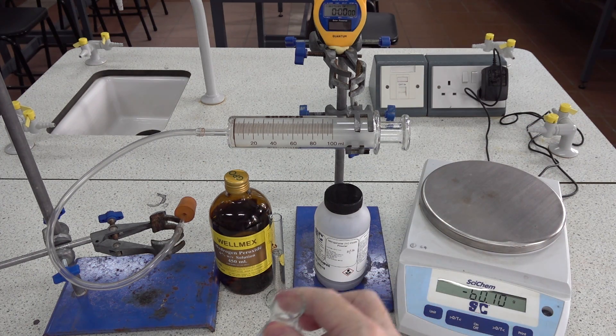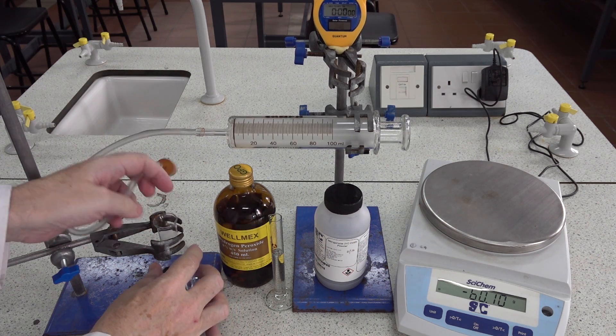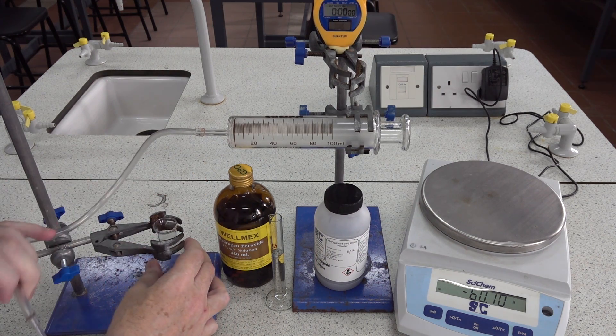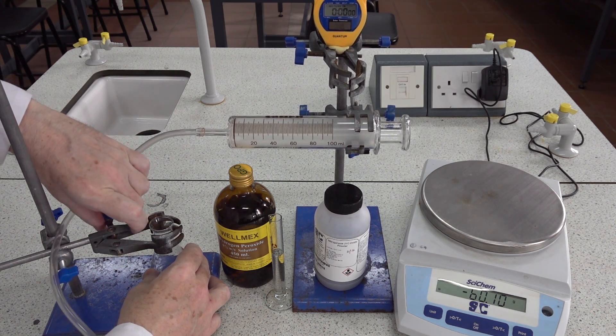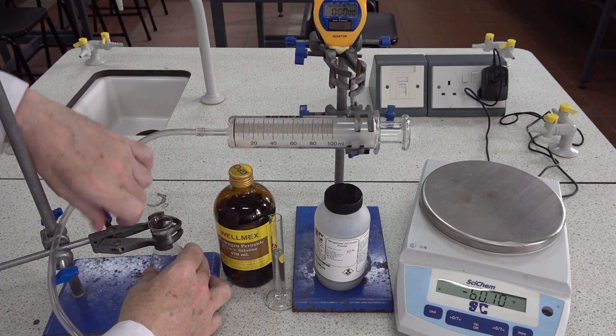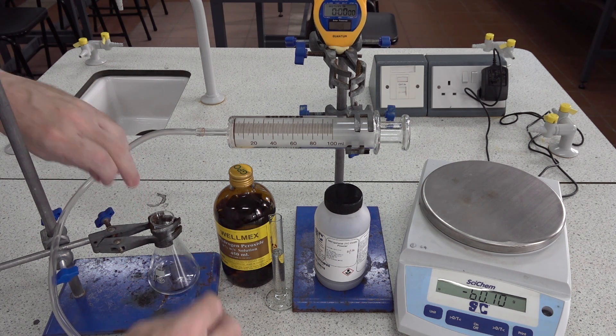We've got 0.1 grams. We now clamp the conical flask in an upright position. You can see that we've got a gas syringe to measure any gas — oxygen gas — that's produced by the decomposition.